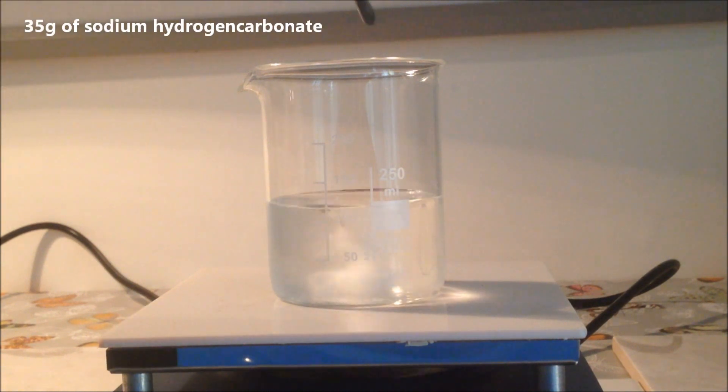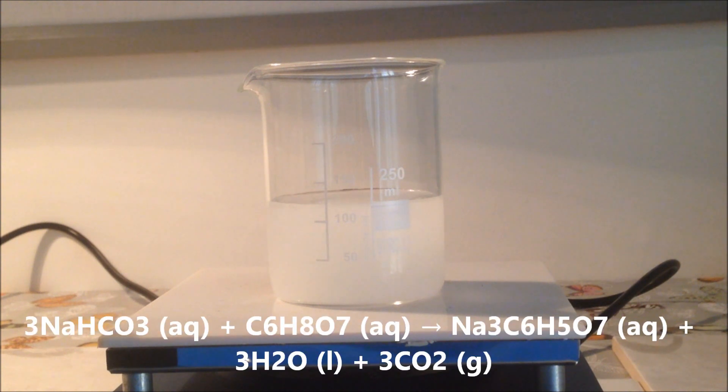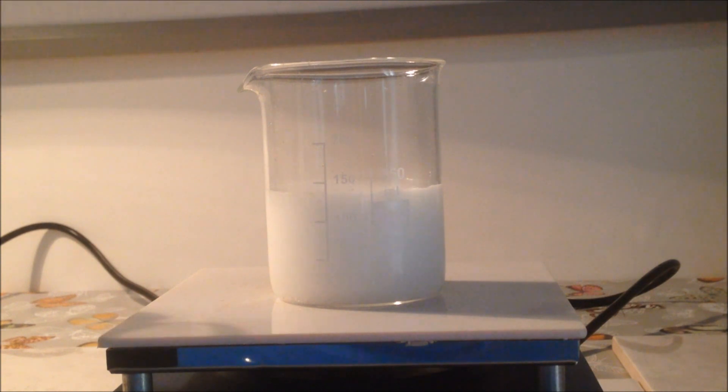I added about 35g of sodium hydrogen carbonate slowly, spatula full by spatula full. You want to be careful of overflowing your container. As you can see by the equation on the screen, it releases carbon dioxide, and this can cause nasty fizzing if you add it too quickly, which has happened to me way too many times and won't be happening to me again.